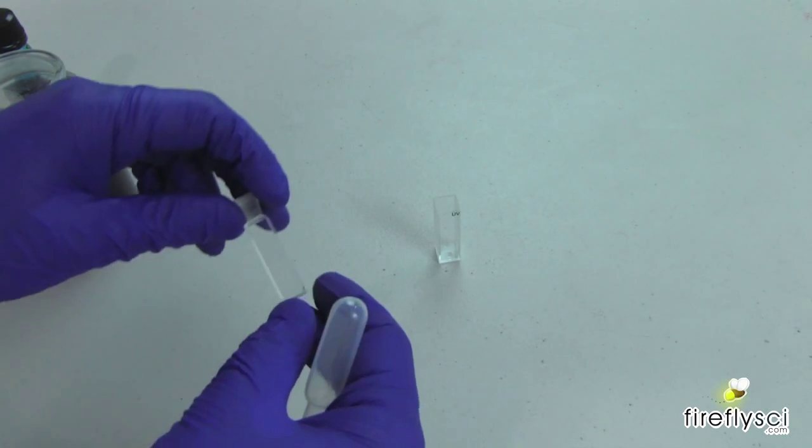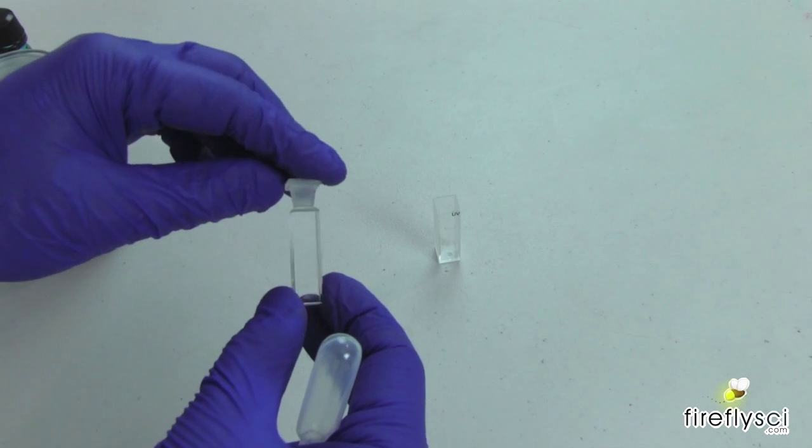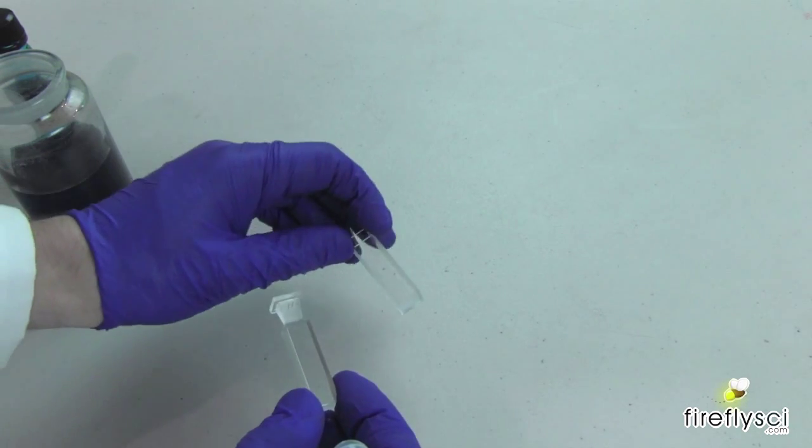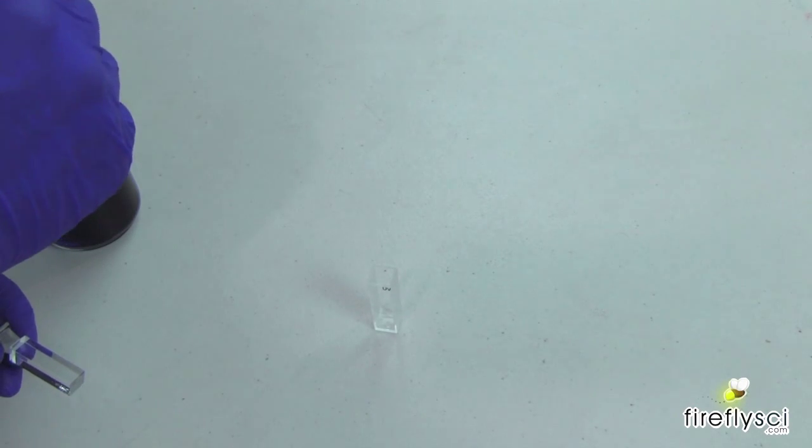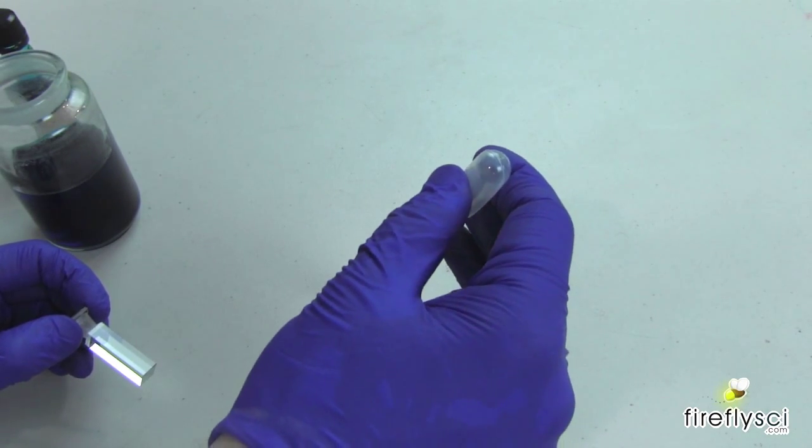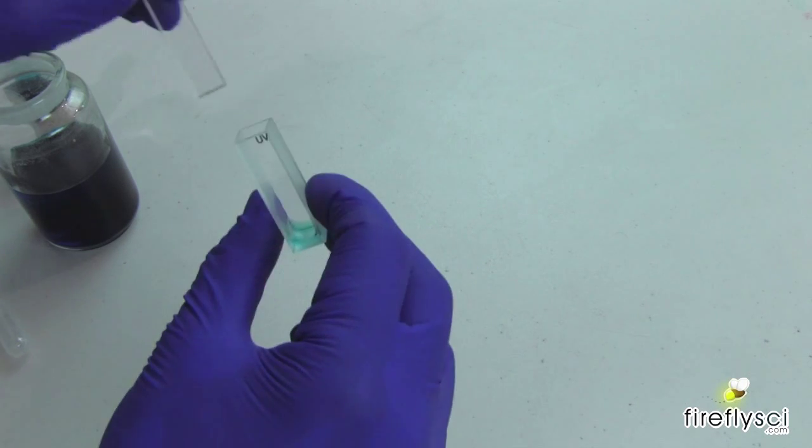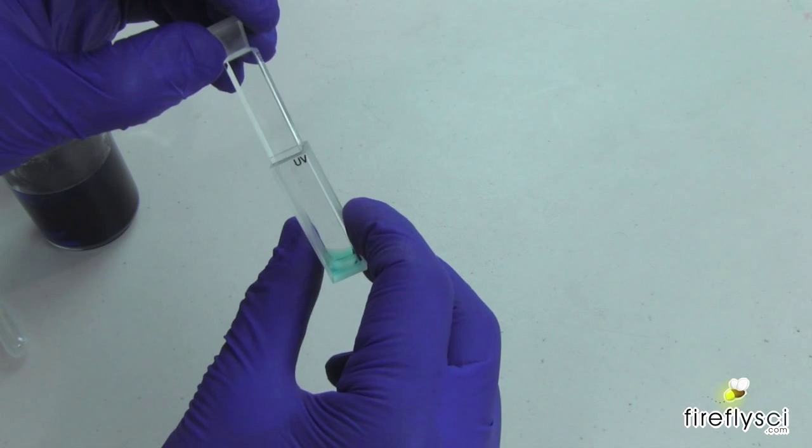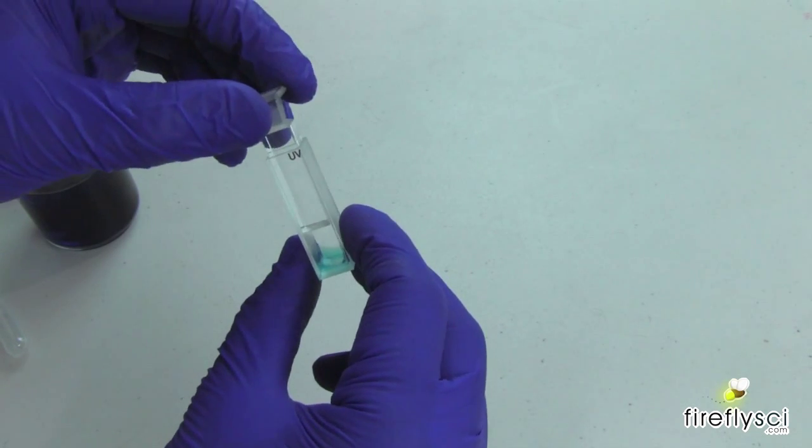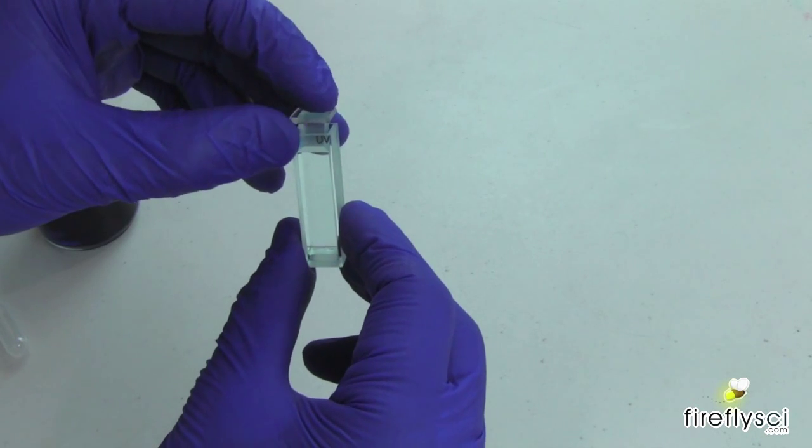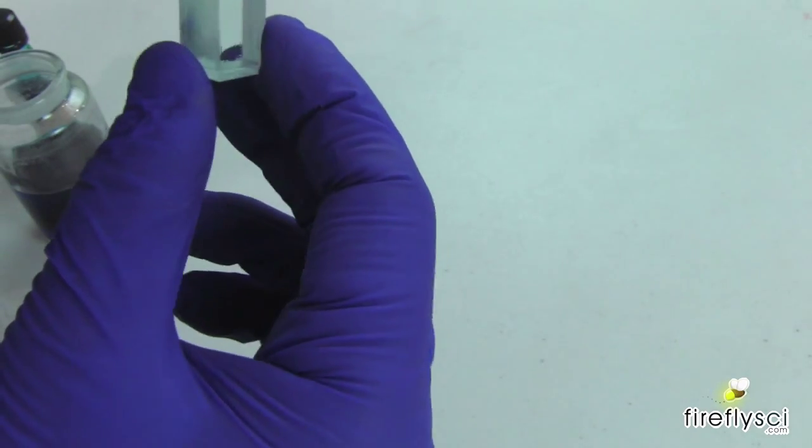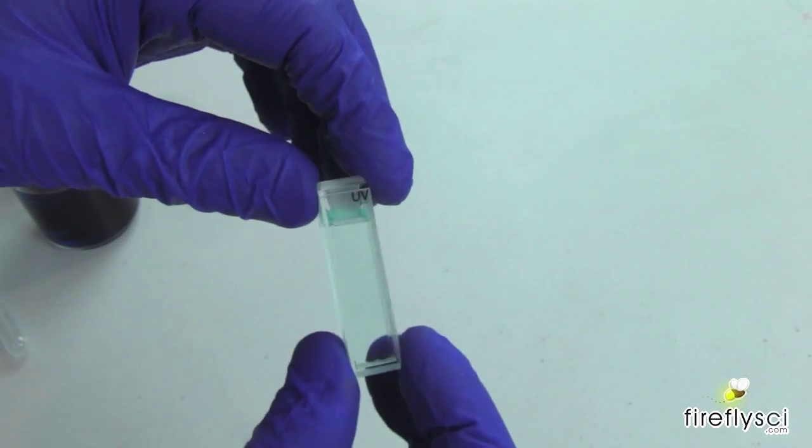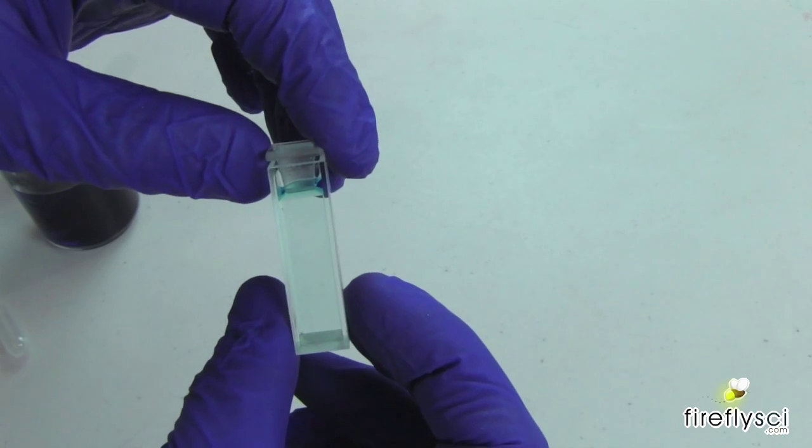Now the last accessory I wanted to go over is our 527 quartz spacers. So what these do is they reduce the volume in a standard 10 millimeter cuvette, so you could use much less volume and still get the 10 millimeter light path. So, let me show you what I mean. Take a little bit of sample from over here, just using a colored sample so you can see what this does. Just put a little bit in the bottom of the cuvette, and so you insert the quartz spacer. And it pushes the sample up the sides of the cuvette, so you can see now it's all blue in there. And the excess sample stays at the top, so it doesn't leak all over on me.